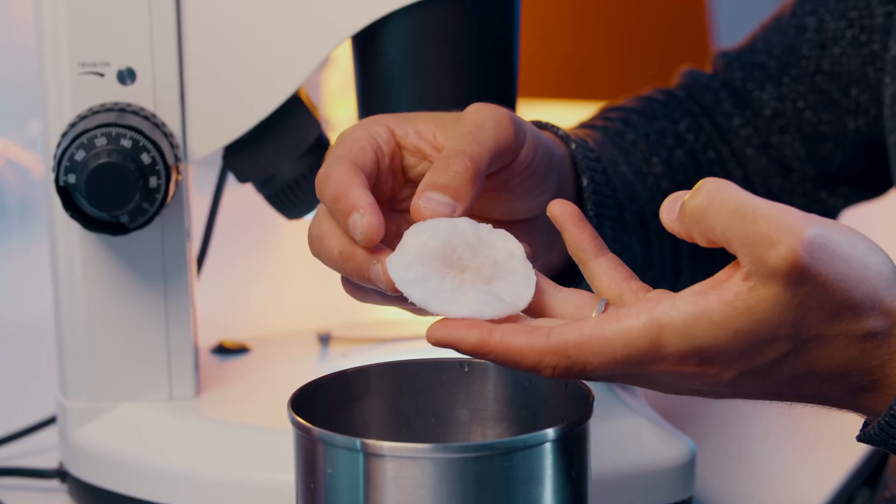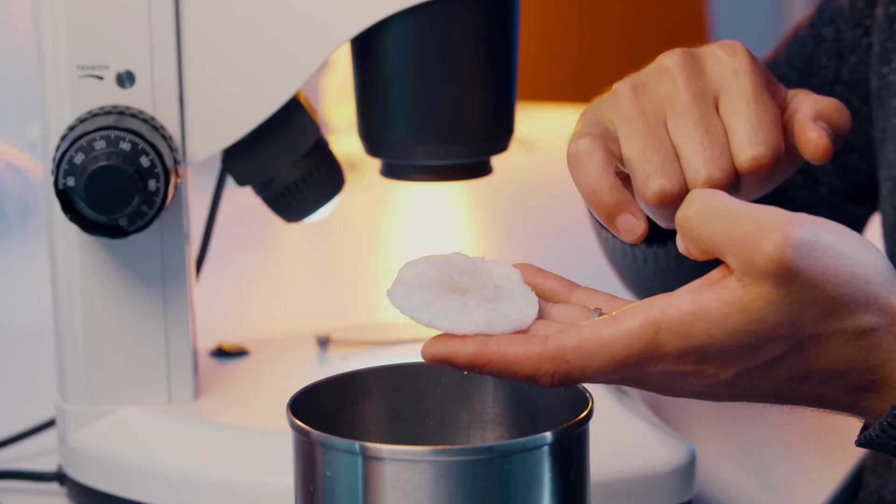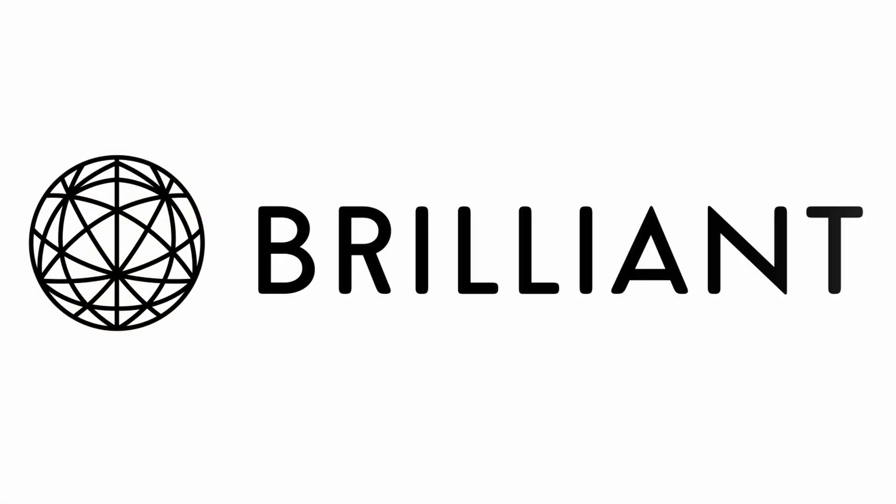Everything's through and you can see here I've got some undissolved sea salt on top. It's quite brown in the middle, but the particles and fibers you don't really see yet.